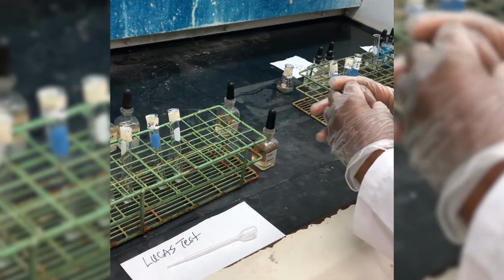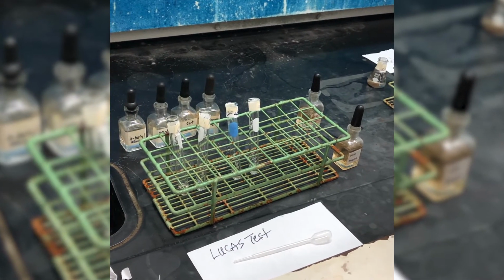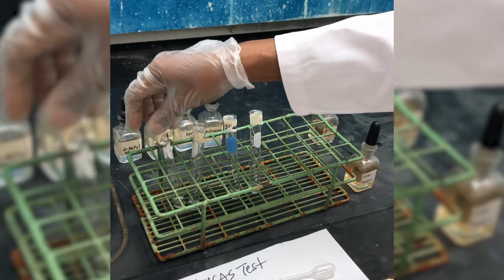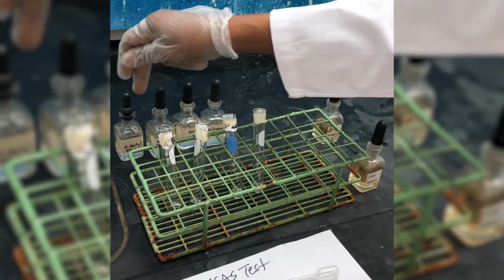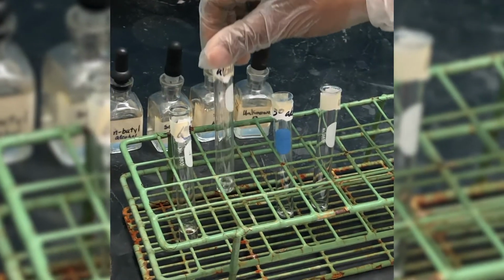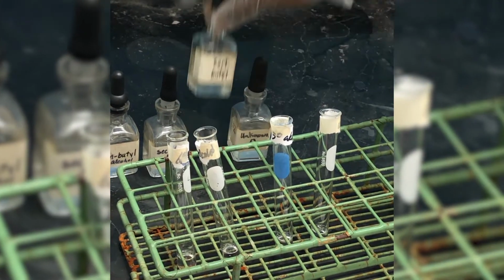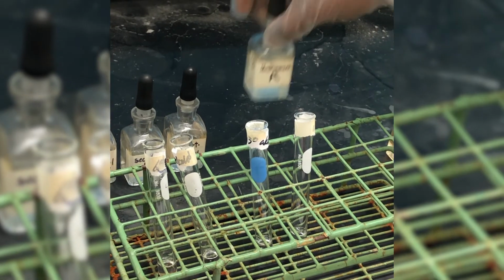So in the alcohol functional group, we're going to use what is called the Lucas test to determine whether we have a primary alcohol, a secondary alcohol, or a tertiary alcohol. In each of the test tubes here, in this first test tube, I have a primary alcohol, which is n-butyl alcohol. The second test tube has a secondary alcohol, known as sec-butanol, and my tertiary alcohol is tert-butyl alcohol, and my unknown is unknown A.